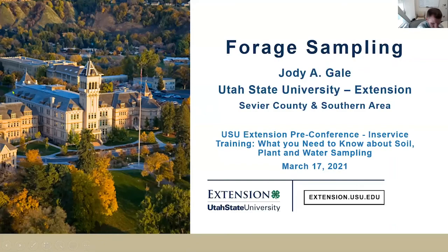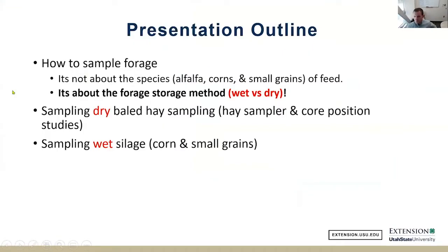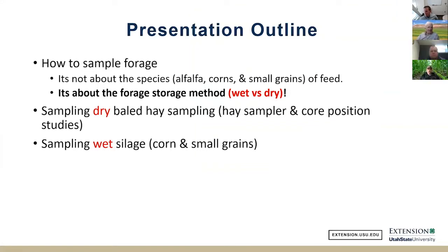Most of my experience in forage sampling, from a research standpoint and a practical standpoint, has been with baled hay sampling. When I was a graduate student long ago, I used to operate the NIRS hay testing laboratory, which was called the Rover Lab. So I learned about extension and had a lot of experience working with growers on pulling dry hay samples. So we'll probably spend most of the time talking about that, but I will attempt to talk a bit about sampling corn silage and small grains per Matt's request.